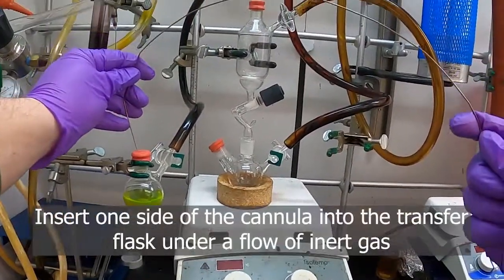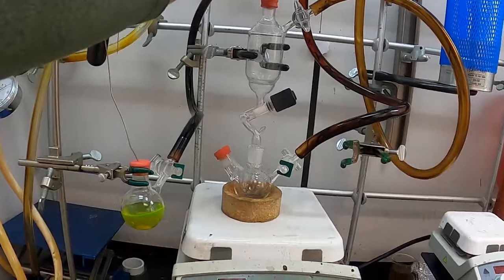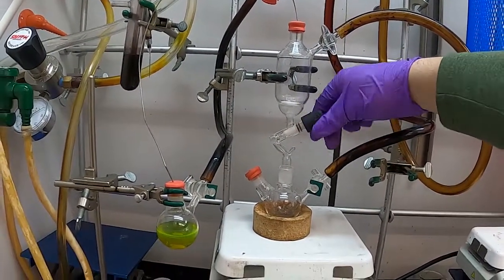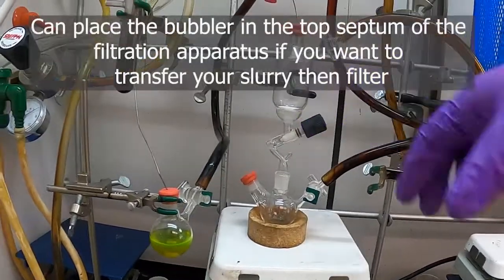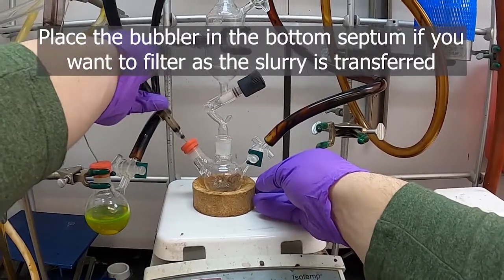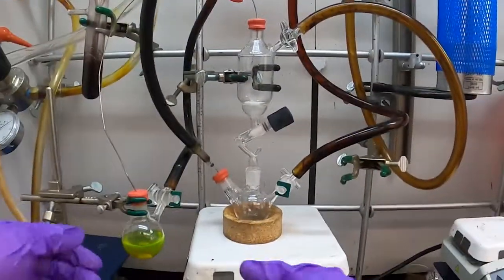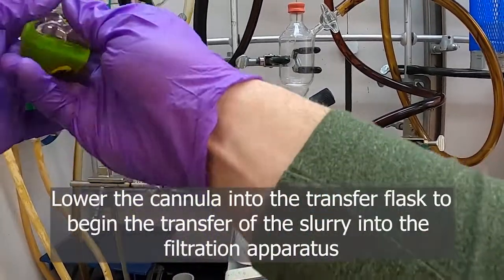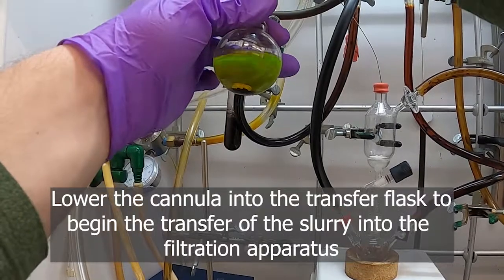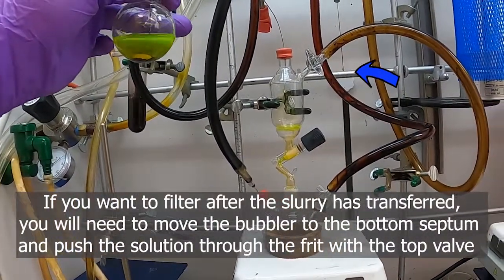With nitrogen flowing on this flask containing our compound, we put our second cannula into it, put that into our flask that we're going to be filtering into, and then go ahead and open our Teflon stopper. Take our bubbler and put that into the bulb. As you can see, we're getting gas going through from up there into there, so now we can take our solution and we're filtering.